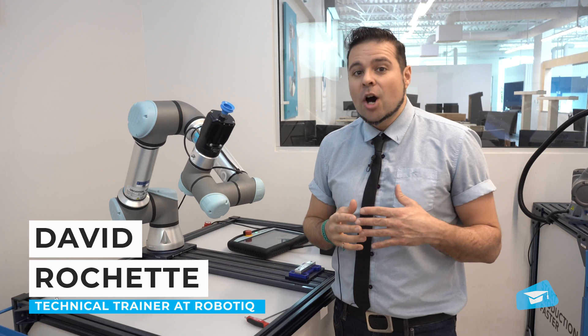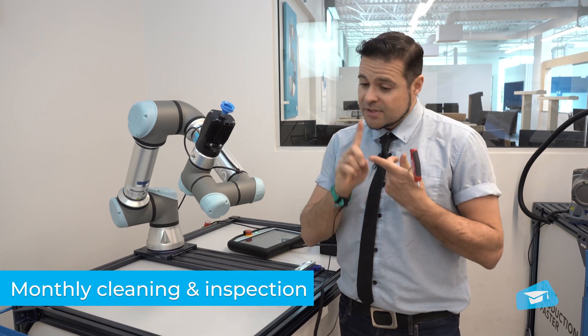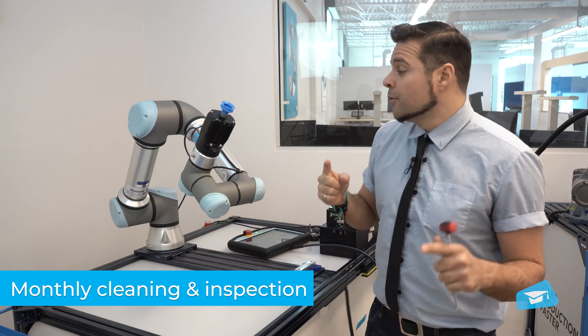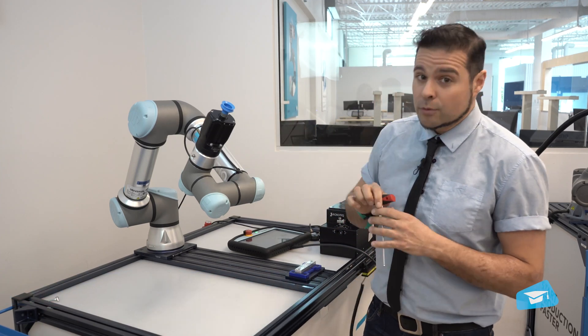Your EPIC vacuum gripper should be inspected and cleaned on a monthly basis. The first thing you'll want to do is turn off the robot and remove those four screws.